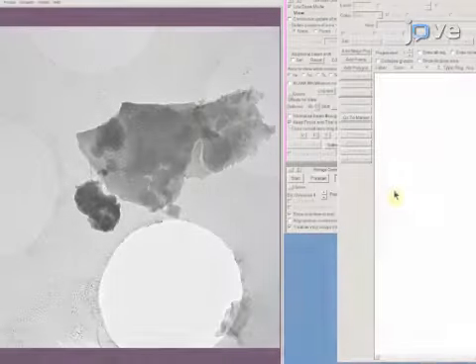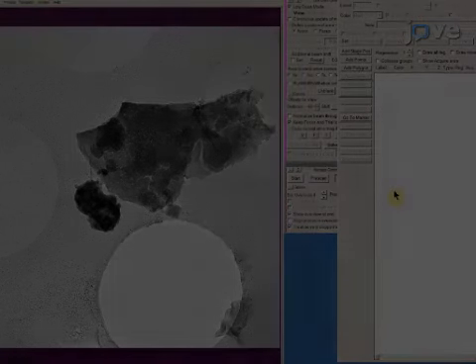While viewing the fluorescent screen at low magnification of about 2300x, find grid squares that are acceptable to image. This location should contain thin ice and the subject of interest with no contaminants. Next, adjust the view to the center of the grid square.